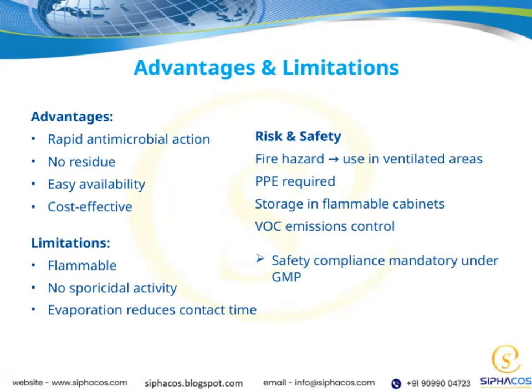When we consider risk and safety, it's crucial to remember that fire hazards are a significant concern with many disinfectants. Always ensure you're using these agents in well-ventilated areas to prevent the buildup of fumes. Personal protective equipment, or PPE, is mandatory to protect yourself from potential exposures. Additionally, proper storage is essential.